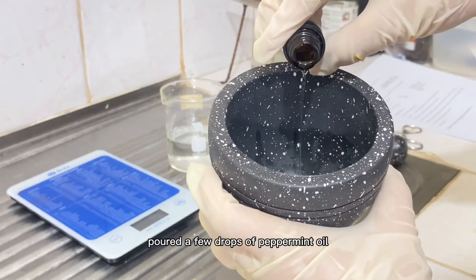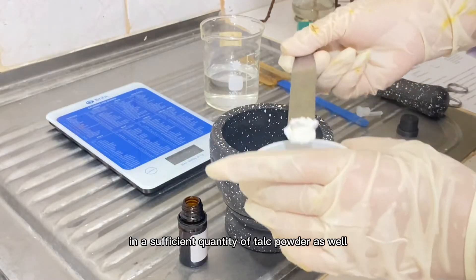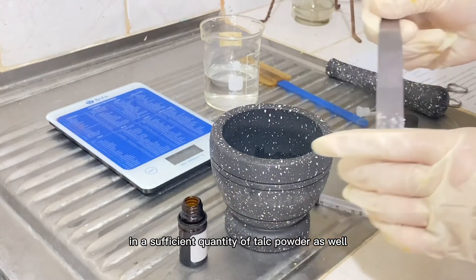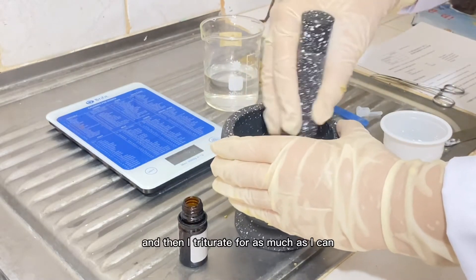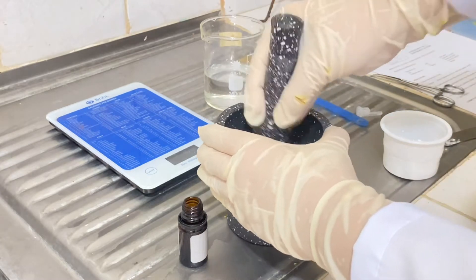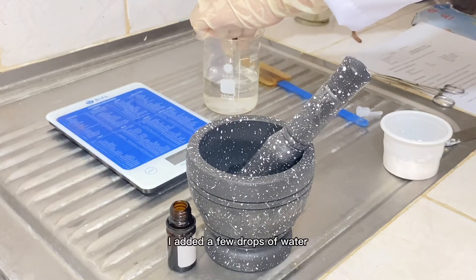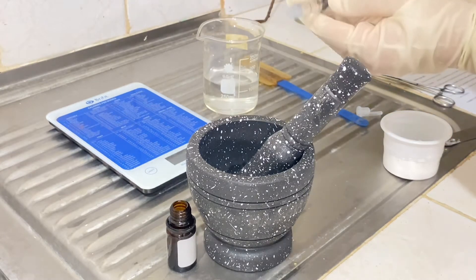I poured a few drops of peppermint oil into a sufficient quantity of talc powder, and then I triturated as much as I could. Then for this part I added a few drops of water.